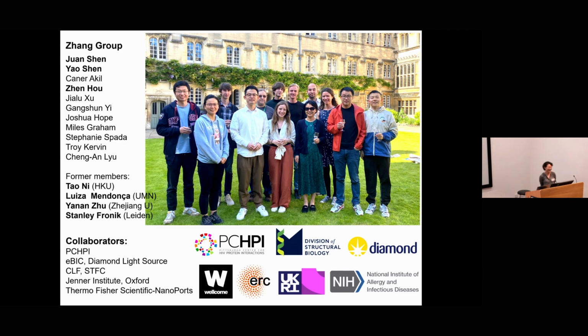Beautiful talk. Can I just ask about the IP6 parts of your talk? I was quite impressed how you resolved these densities. I think I have PTSD of Bevirimat-treated capsids. How did you manage to take care of these phantom densities that appear near the symmetry axis? Yeah, we don't know what they are yet. I think some are probably real densities. We just don't know what they are.